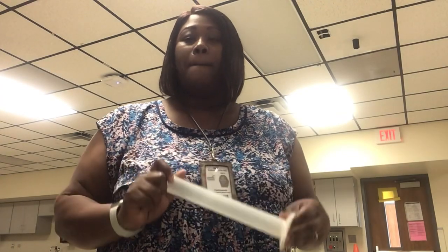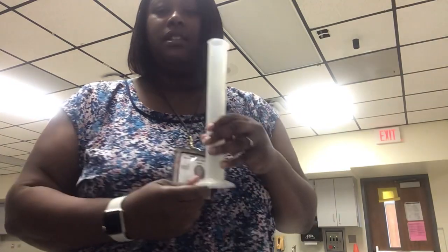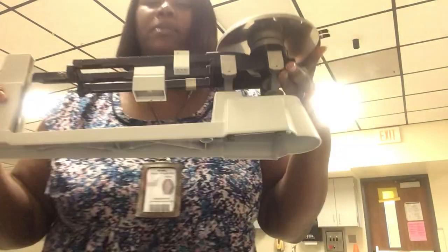You might recognize these tools from our scientific tools lesson when we talked about the tools we're going to use in the lab. So, when we're calculating density, we're going to use the formula mass divided by volume. We're going to use the graduated cylinder to get our volume, and of course the triple beam balance to get our mass.